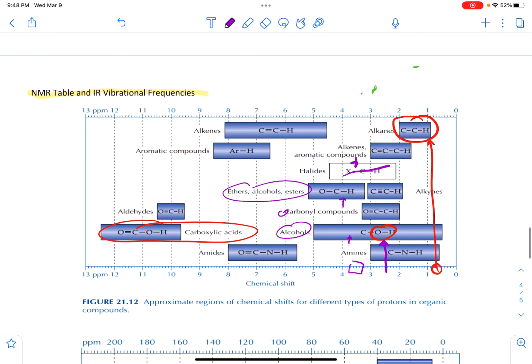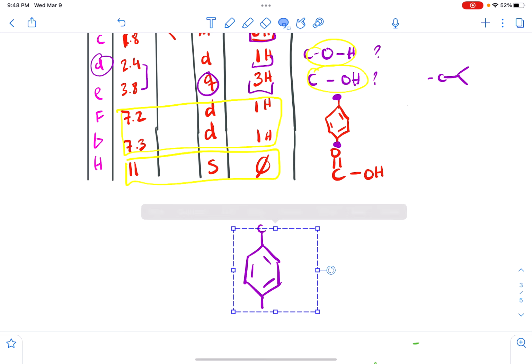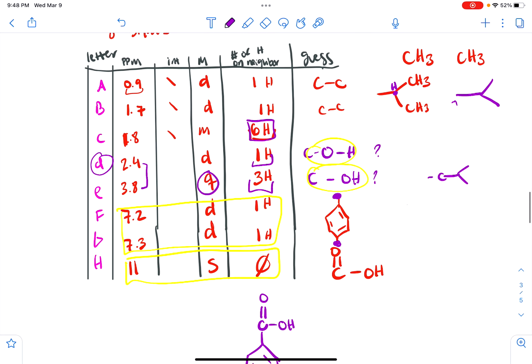That is because the aromatics are right here, the carboxylic acid is right here, and we don't have any other mess in that. So we've got this carboxylic acid, which is going to be represented just like this. So we've got our O and we've got our OH. And that's all we know right now, aside from our isopropyl group.